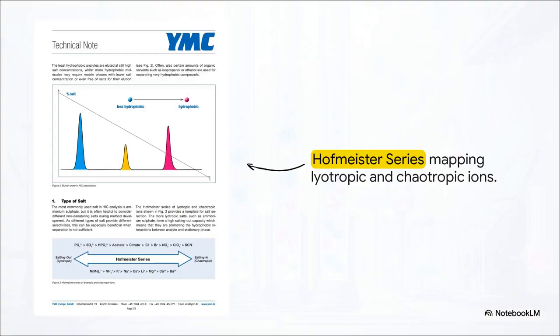Of course, the absolutely crucial point here is choosing the right salt. We can't just dump in any old table salt, right? We typically rely on highly lyotropic salts, like ammonium sulfate. If you look at the Hofmeister series here, they sit way over on the far left. These lyotropic or salting out ions have a massive capacity to promote those hydrophobic interactions without actually precipitating your protein out of the solution entirely. Ammonium sulfate is pretty much the absolute gold standard for striking that perfect balance.